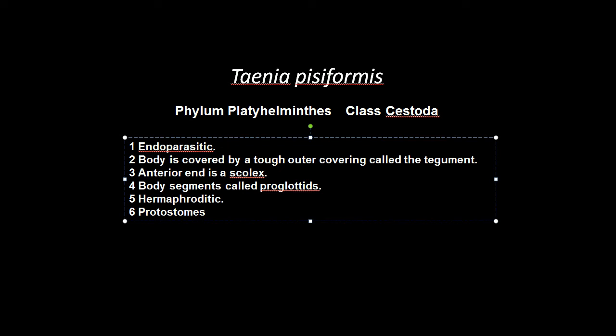Taenia pisiformis, the tapeworm, Phylum Platyhelminthes, Class Cestoda. This is an endoparasitic organism that has a body covered by an outer covering called the tegument. This keeps it from being digested by its host's digestive system.